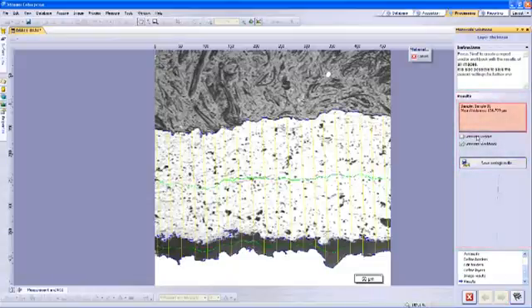Within Results, we will see the mean thickness value for all of our selected layers for this sample, and we have the ability to select to generate a report and a workbook. We will select both here and then click the next arrow.